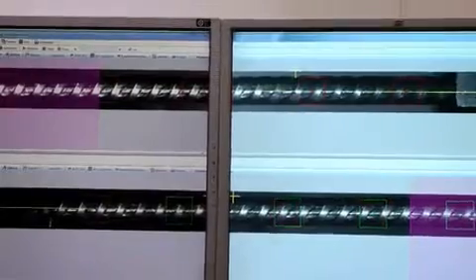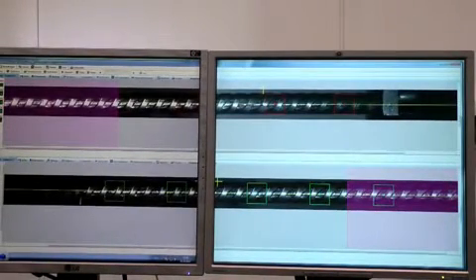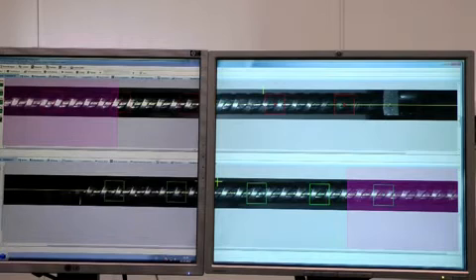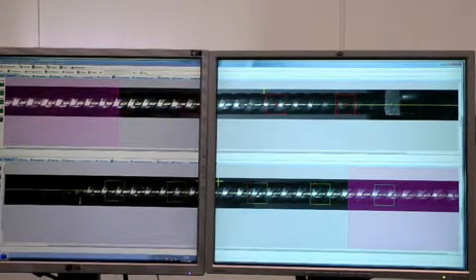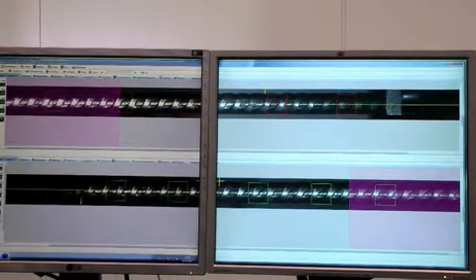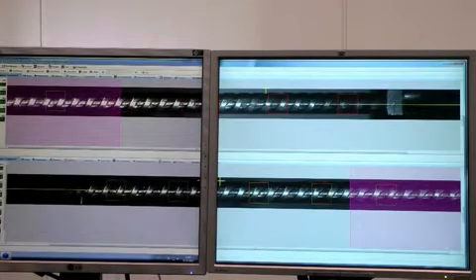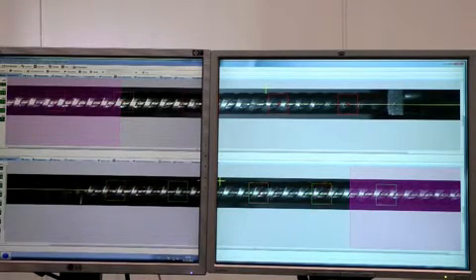At the end of the test the Video Xtens will measure around the necking point because it recognizes that the maximum strain is occurring exactly there. Therefore it is able to center around the necking point with the measurement gauge length.